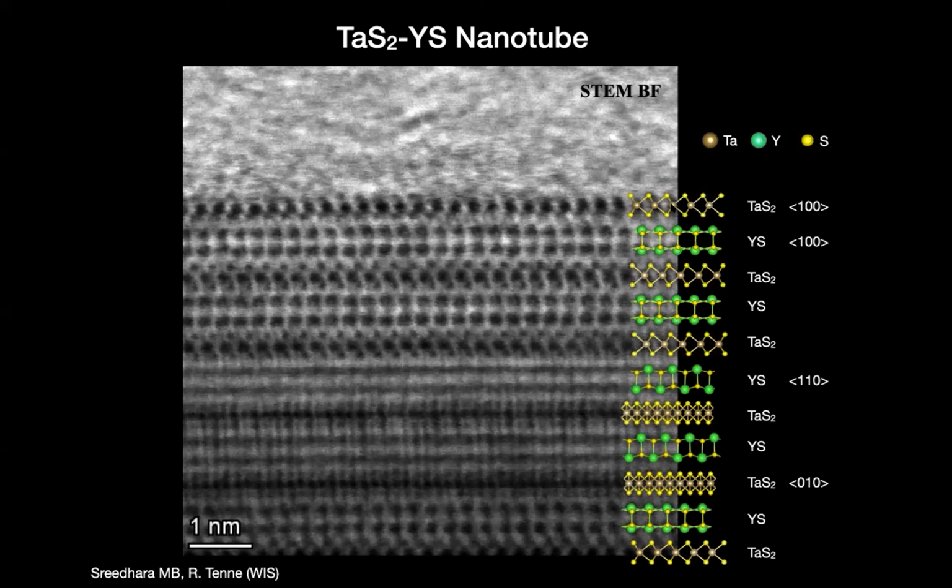Thank you. And the second question is, I'm curious to know if it is possible to image magnetic 2D molybdenum fluoride, molybdenum fluoride using HRTEM. Or chromium germanium telluride, similar stuff.